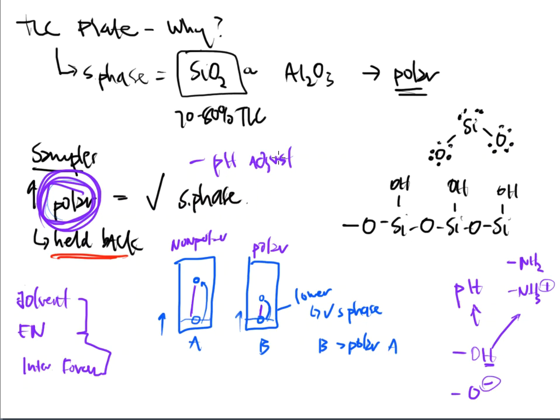The pH dependency is very important when it concerns polarity, because it can make these molecules do things they couldn't do before, and that is to carry full-blown charges. And that could really switch up the order of what you would expect when you develop these samples on a TLC plate. So keep pH in mind. It can affect the order in which things run, and you might be forced to adjust some pH in a laboratory at a certain point in time.